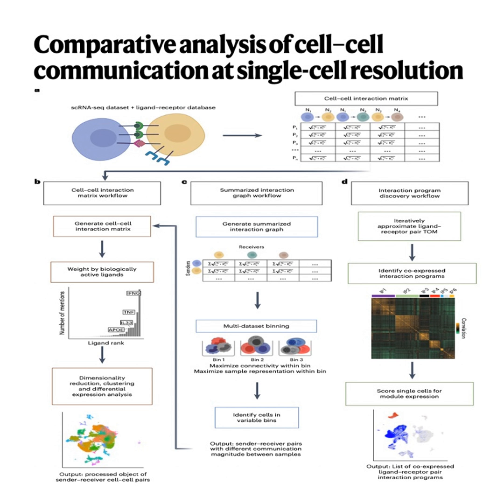So what did Scriabin find instead? By using the bins to compare equivalent cell states across all samples, it correctly identified a specific subset of T cells marked by the gene CRTAM that were significantly upregulating interferon gamma, IFNG, specifically in the RR granulomas. Interferon gamma. That rings a bell in leprosy. It's biologically known to be a key driver of that RR state.